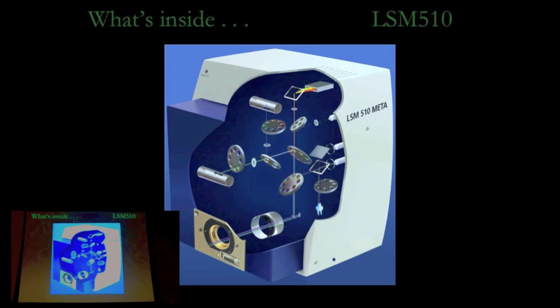And then last, the detector is a photomultiplier tube. It has a very fast response time, with maybe 25 to 30% quantum efficiency depending on the PMT. But basically, a quick way to describe how these work: it's a vacuum tube, light comes through a window and causes electrons to be let loose.